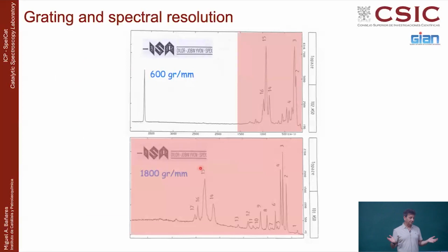So what do we do? Well, in the spectrometers, basically, okay, you get the low resolution, then you get everything. You get a group photo. Like with the telephone, you make a broad view angle, fine. But then I cannot see your details. Or I make a photo, and a photo, and a photo, and a photo, and then I can see all of you with many details. But when you connect the photos, things do not match perfectly.